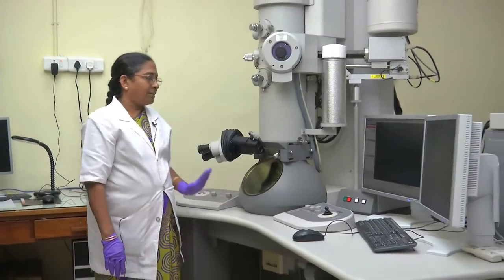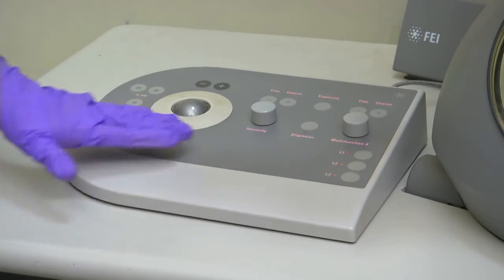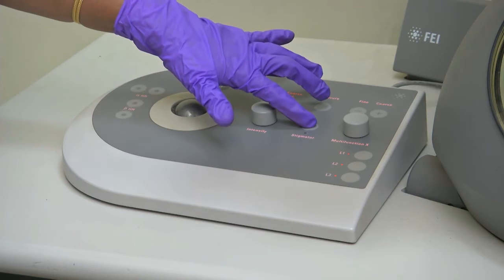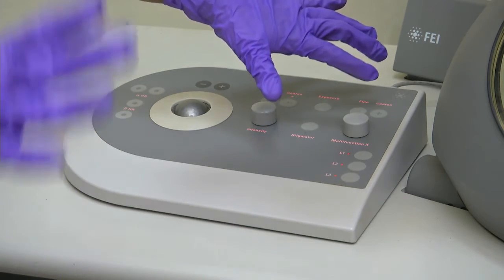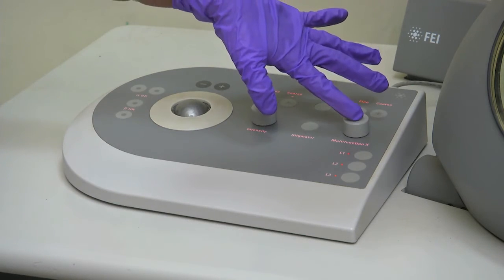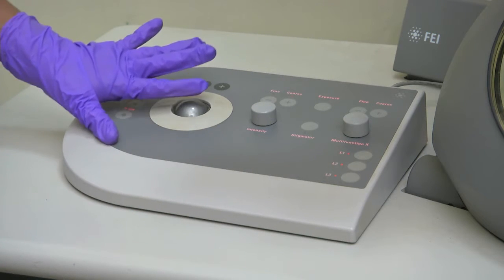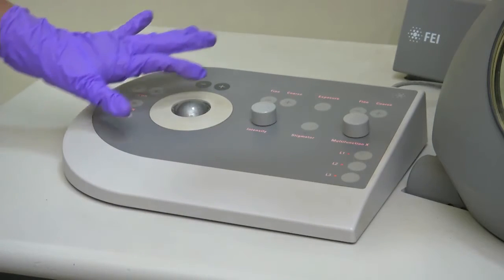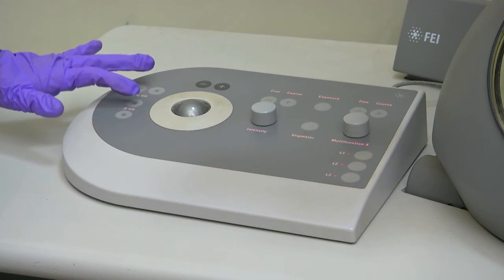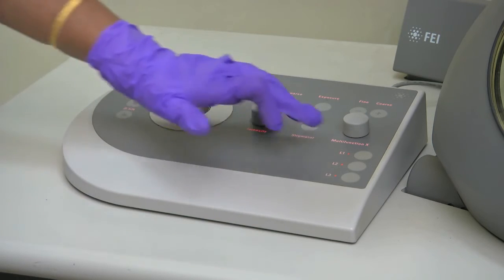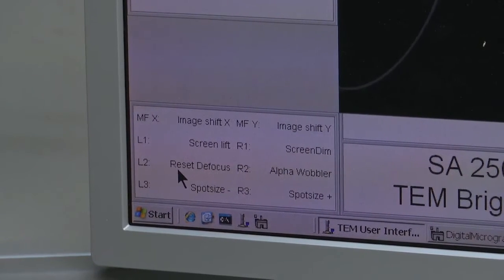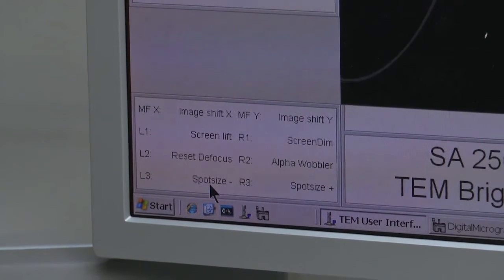Some controls are different here. The left side control panel has a knob for controlling the intensity. There is a stigmator control, and a multifunction knob — as in the CM12, you can do stigmatism correction and shift the beam. There is also a trackball to move the beam in the x-y direction. There is a tilt control: a goniometer tilt knob and a holder tilt knob. Optional functions L1, L2, L3 are selectable — L1 is for screen lift, L2 is reset focus, and L3 is spot size reduction.